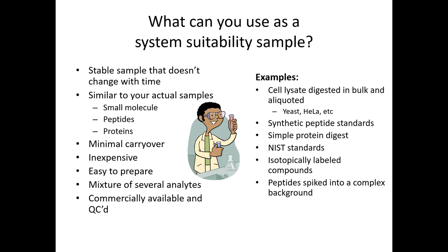Certainly. So you mentioned a couple of reagents, right? So HeLa digest and BSA, these things we also usually use for testing the stability. How stable are they, from your experience with commercial vendors?